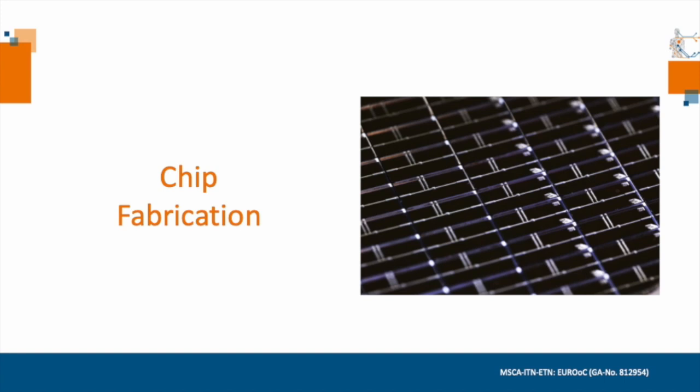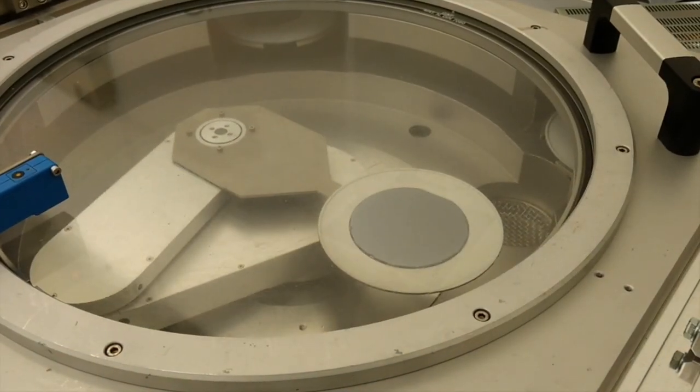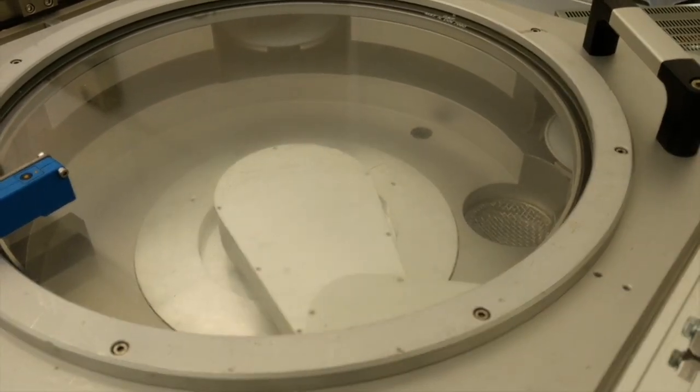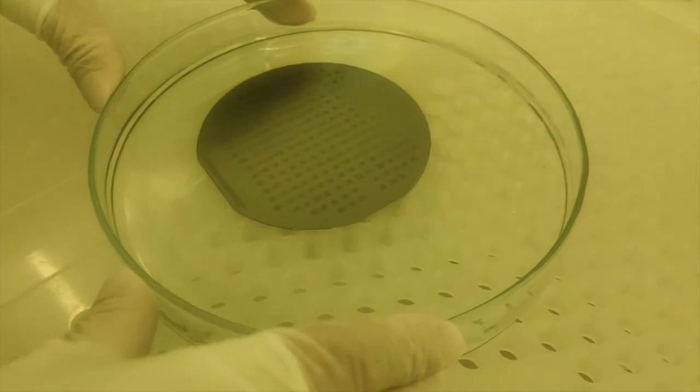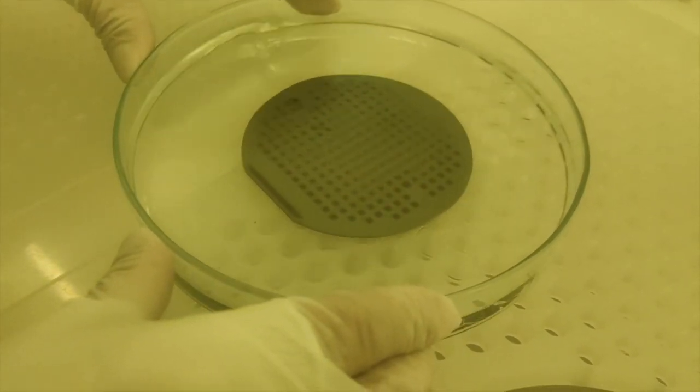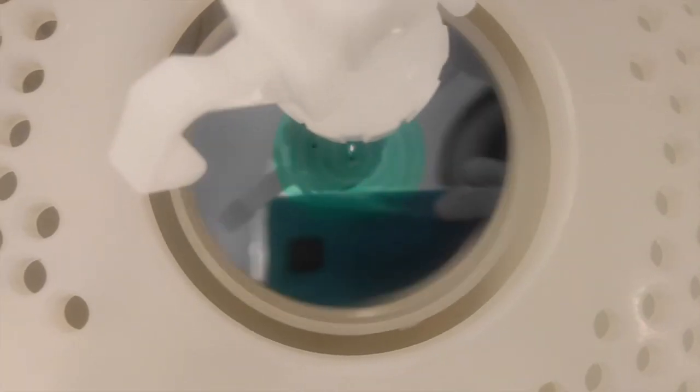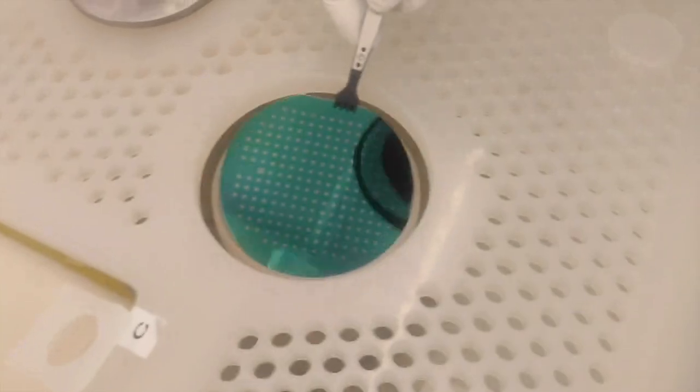To be able to work with the chips, we first have to make them. The fabrication method of the chip depends on the materials that are used, and we will show you a few examples of our methods. To replicate small features, lithography processes are usually used, where the shape of the chip design can be transferred onto our material with a thin film of light-sensitive plastic.